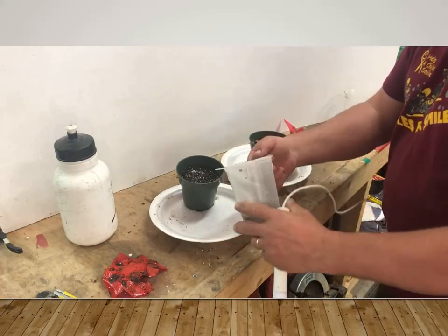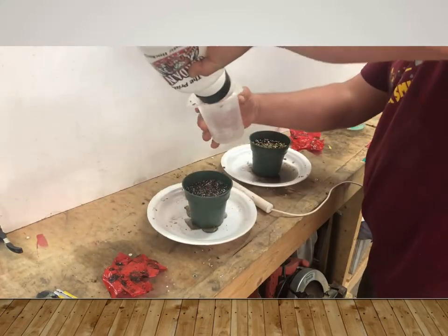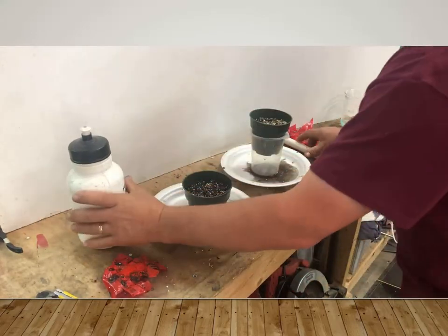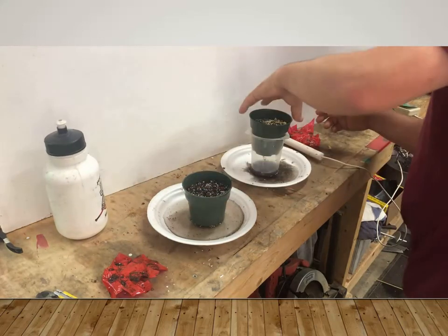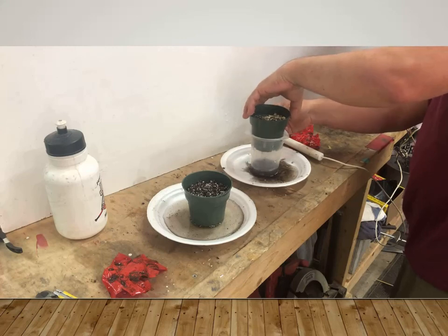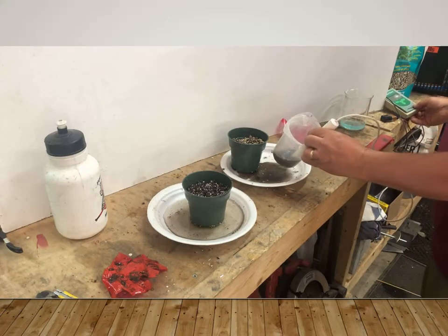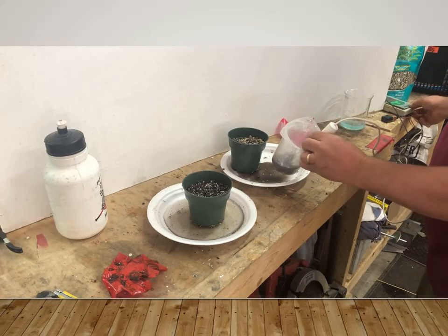Okay? I'm going to dump this into here and maybe to try to be a little bit empirical, we'll give this a bit of a rinse. Dump it there. I'm going to give my probe a bit of a rinse. Okay, let's put this here, and this really could be a lot more empirical, but you get the gist. Okay, let's get our probe in here. And the EC, an EC of 3. If you don't believe me, I don't know if you can see it on there, but I'm not lying.